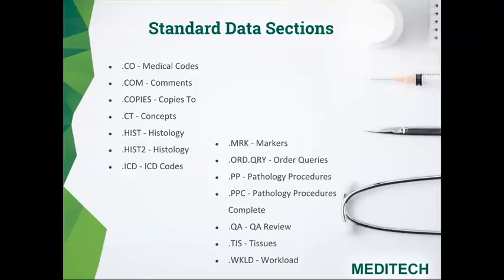This data section is used to list all the pathology specimen codes that will be used for a pathology specimen. The .com, which is the comment. This is a text editor which allows you to enter general comments about a specimen. It will appear automatically in enter-edit requisition and also in the enter-edit findings routine.